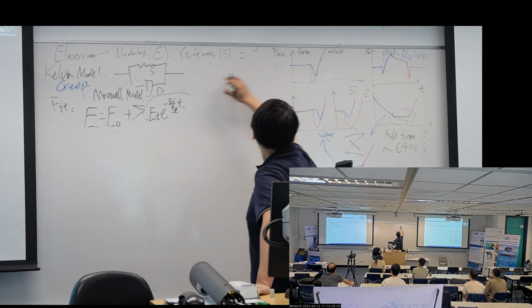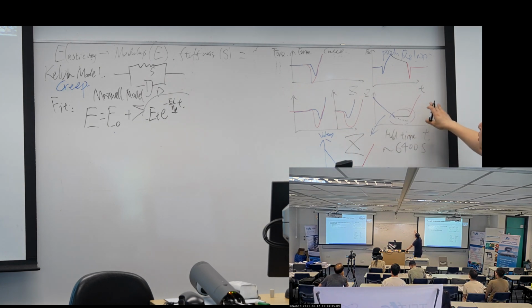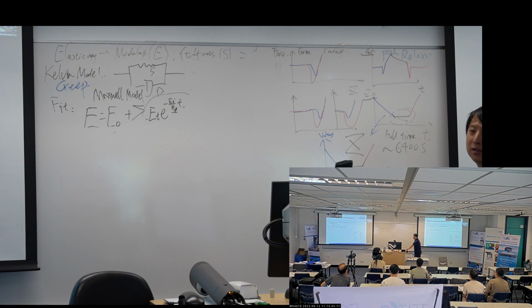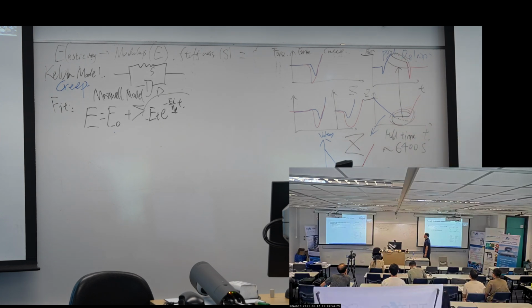After we do this kind of creep or relaxation, we capture the force change against time and the Z change against time, and nowadays the software can do hold analysis, so it can directly take out this section.